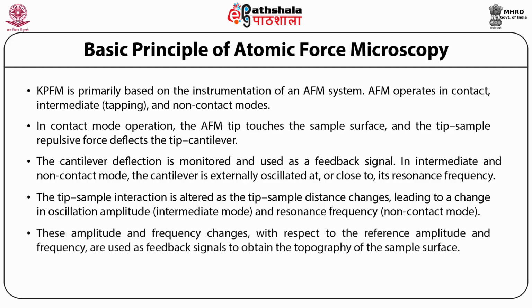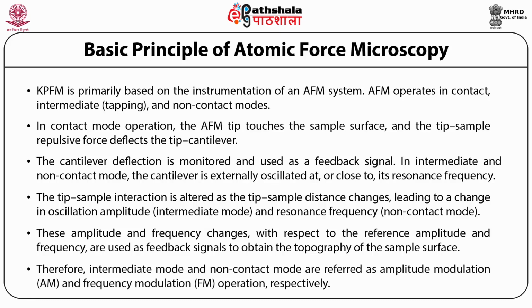These amplitude and frequency changes with respect to the reference amplitude and frequency are used as feedback signal to obtain the topography of the sample surface. Therefore, intermediate mode and non-contact mode are referred as amplitude modulation and frequency modulation operation respectively.